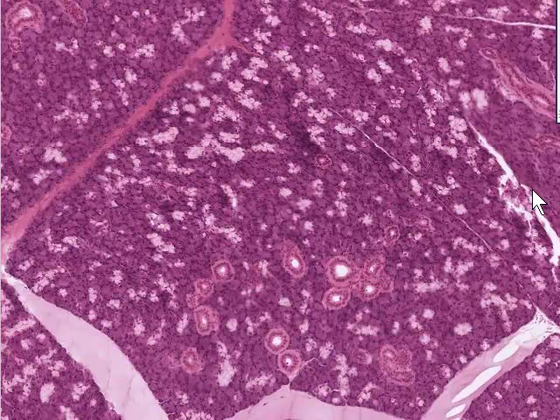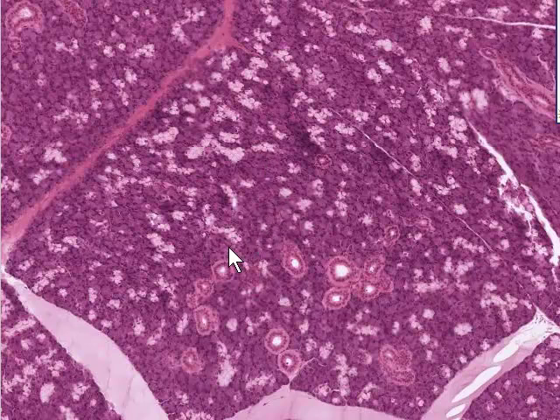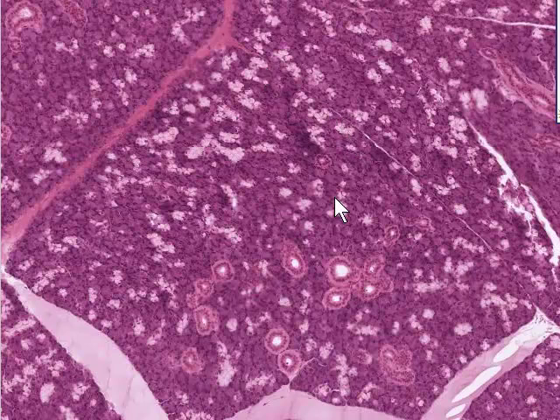At higher magnification of the submandibular gland, we can see intralobular ducts, which are within a single lobule. There is connective tissue separating the lobules. In and amongst the dark purple staining material — the secretory serous acini of this gland — there are very much paler, mauve, foamy-looking areas, and these are mucus acini. We'll take a look at these now in a little more detail at even higher magnification.